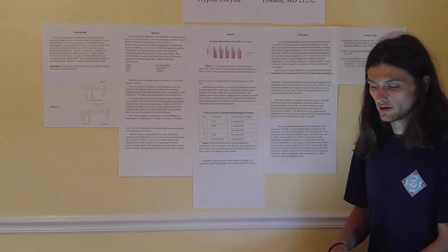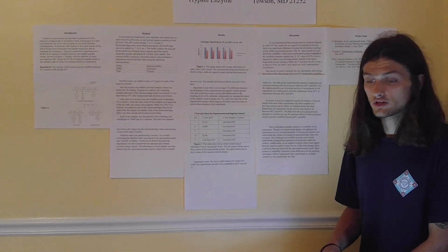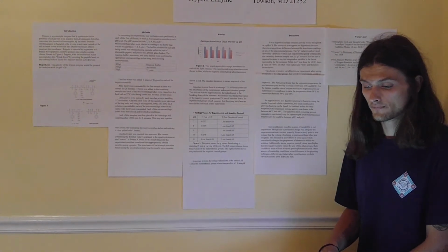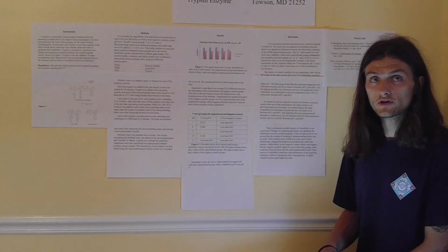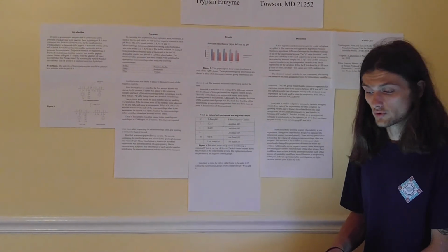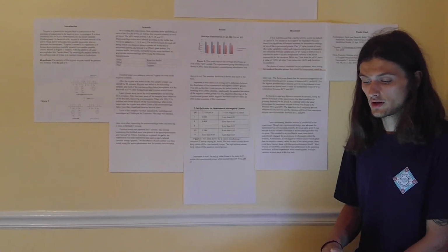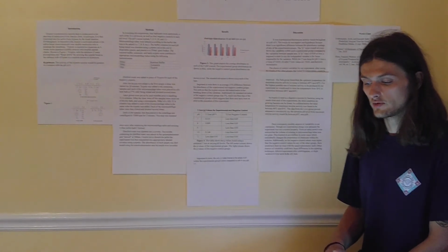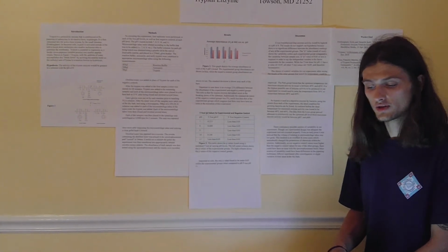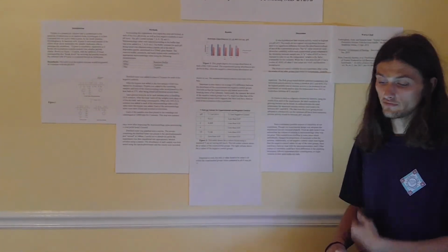Other sources of variability could have been differences in pipetting techniques, leftover supernatant after centrifugation, or slight variation in time spent in the dry bath. Between the first and second experiment, one additional replicate was added, negative controls were added, and 5 pHs were tested as compared to the 3 originally tested. To further improve upon this experiment, it would be beneficial to add additional replicates, as well as narrowing the windows of the pHs by, for example, using pH of 8.5 or pH of 9.5.